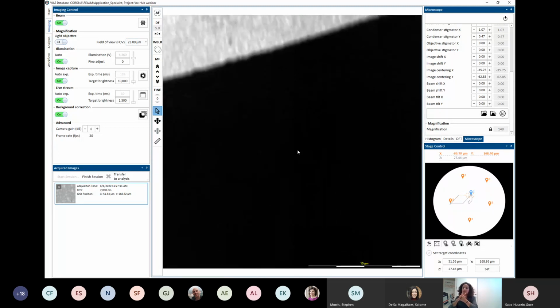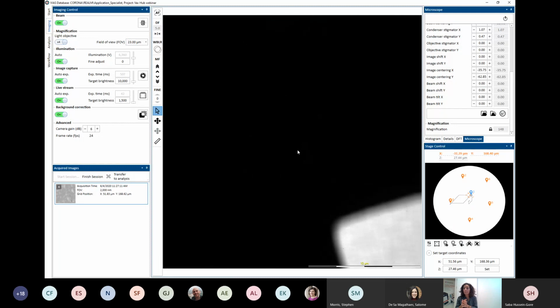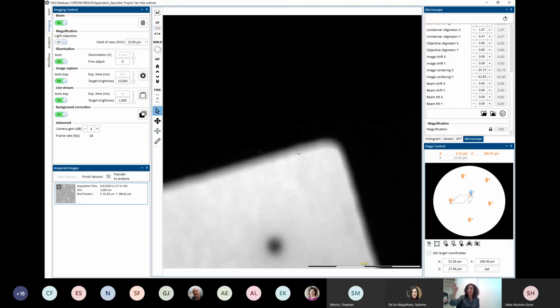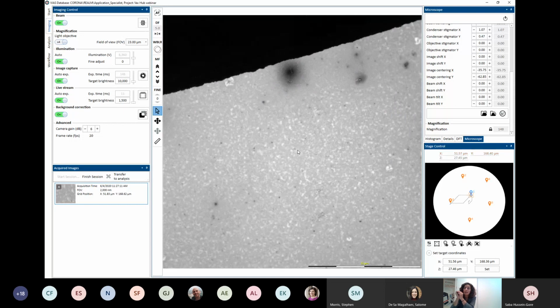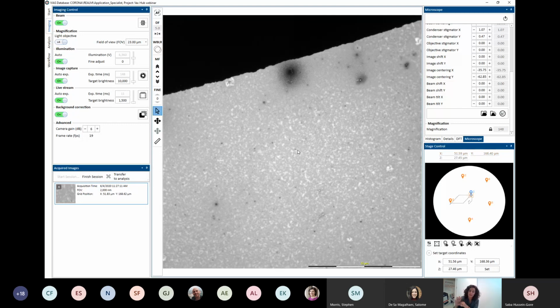And I know in some instances, there's only been, let's say, 5 or 10% that looked okay, but they contained, and that was not for generating statistics, but just for pure imaging, for writing a paper. And they were able to take a bunch of images just in that specific region.